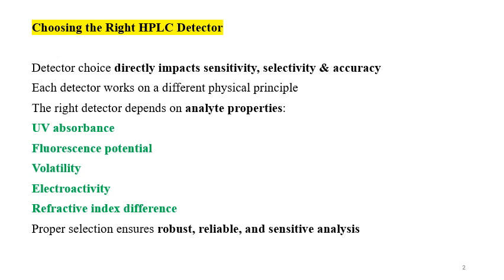The properties are UV absorbance, fluorescence potential, volatility, electroactivity, and the refractive index. Based on the analyte properties, we need to select the proper HPLC detector, and this HPLC detector should ensure the analysis is robust, reliable, accurate, and sensitive.